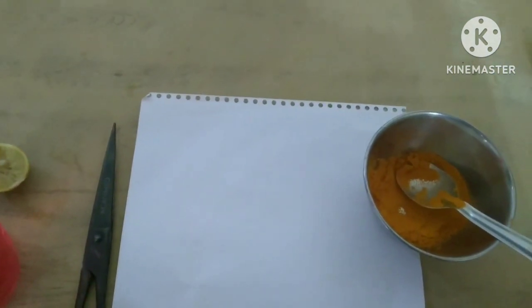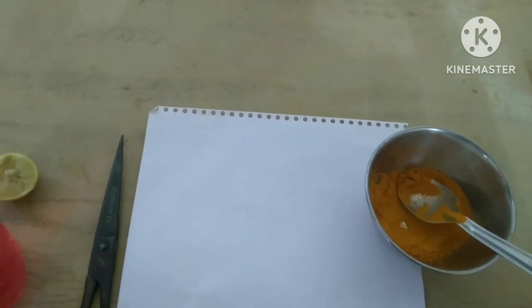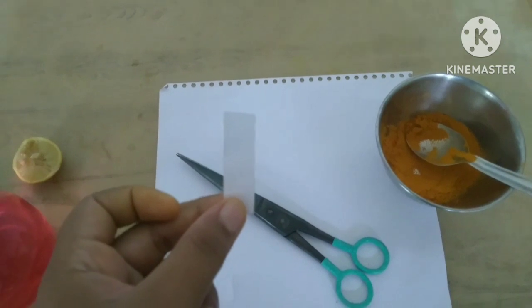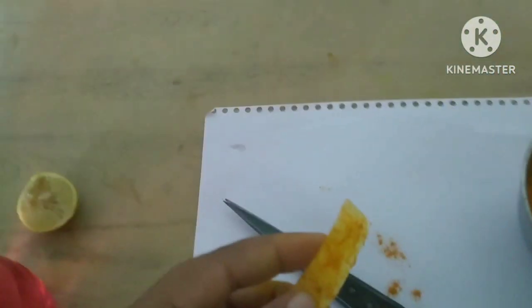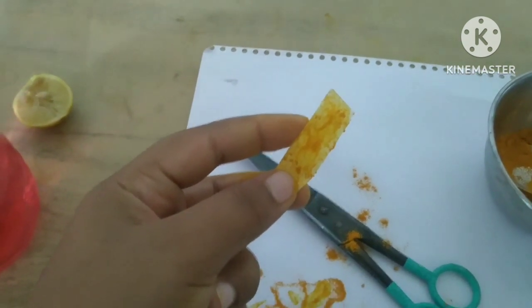First, cut the strips of paper. Only one strip of paper to prepare an indicator. Like this, cut a strip of paper. Put some haldi on paper, and keep it in sunlight for 15 minutes to dry.